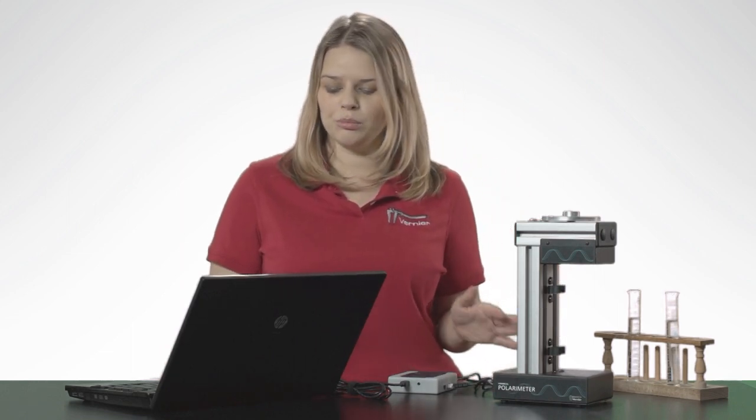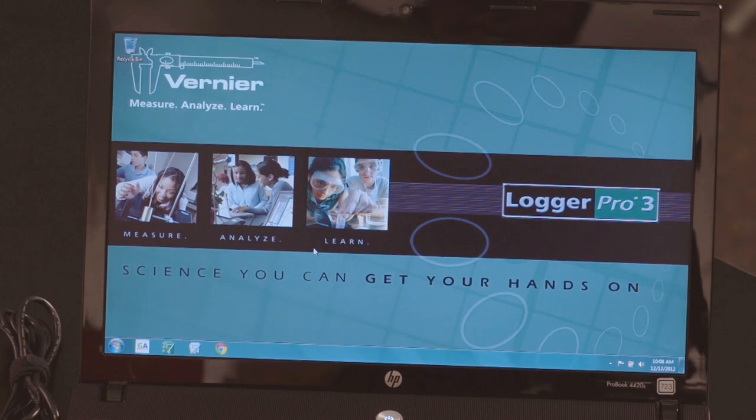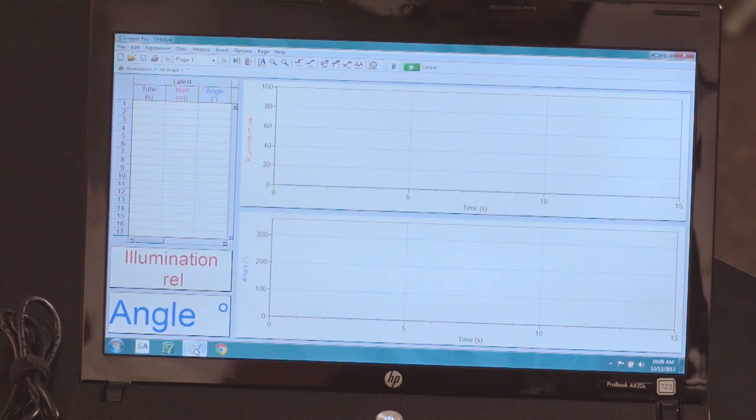Now that I have everything plugged in, I'm going to open Logger Pro. You need to have Logger Pro 3.85 or newer for the polarimeter to work properly.